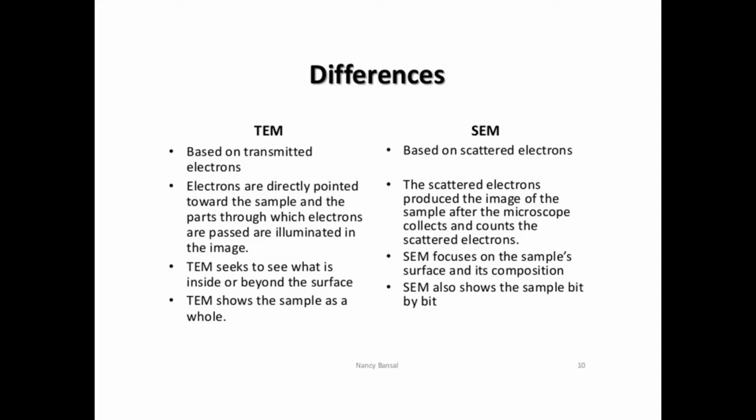Like a punching machine making a punch in paper, only that much sample size is needed, and it should be thin enough for electrons to pass from one side to the other. Otherwise it is very difficult, and the sample preparation procedure for TEM is also very difficult.